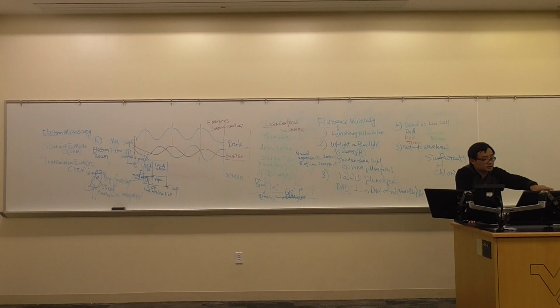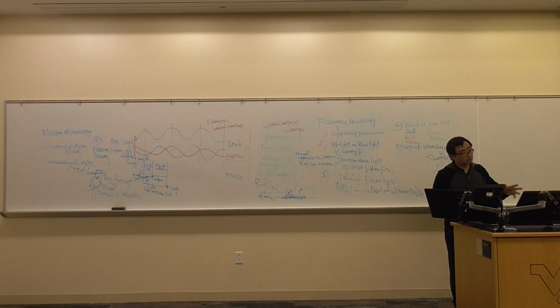They will generate these very beautiful colors. They will show the width, height, and roughness of a bacterial surface. And they have a computer system called Measure It. This is what I just did in the lab, and my graduate students did.